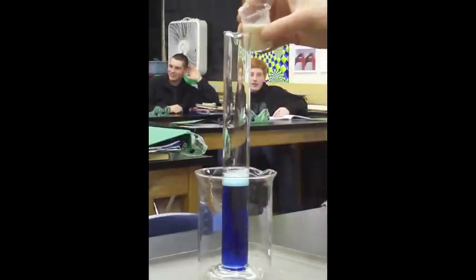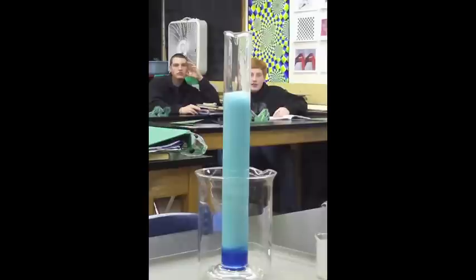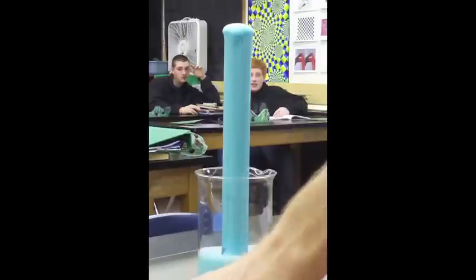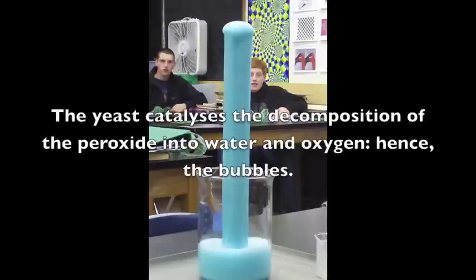All of those bubbles are being produced by the peroxide reacting with the yeast — they're full of oxygen. We're going to show that they're full of oxygen in a minute by using the old glowing splint test.